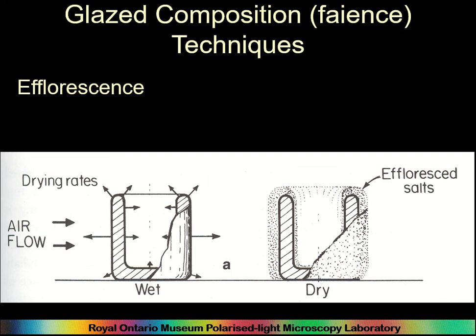In efflorescence, it is the glaze mostly which fuses everything together, and so in this there are salts added. I think sodium and things like this are a flux which enables silica to melt at a lower temperature, and so is what you could make a glaze with. And so they are allowed to dry, and the salts effloresce to the surface, and so they form a layer around the surface, and they will then form a layer of glass when it's fired.